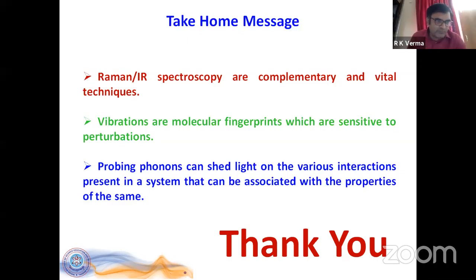Pre-IS has written, what is the practical approach for first and second order Raman modes? Practical approach? Well, I'm not very sure if I understood the question. If I have a sample and I measure the Raman spectrum, and I do some theoretical study, it doesn't mean that I have to go into a proper calculation, but do some simple modeling and see what would be the first order Raman modes, that means the normal modes of vibrations that would be expected. Then one can see that these peaks in the spectrum could be the first order modes, but anything beyond that could amount to second order or higher order modes.